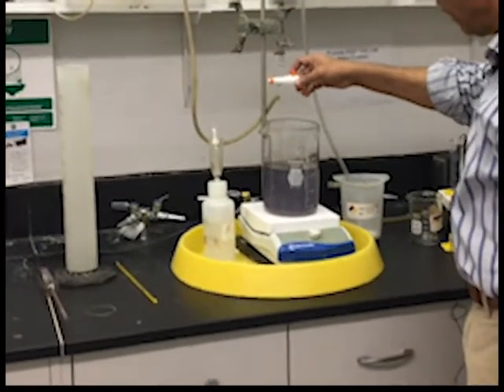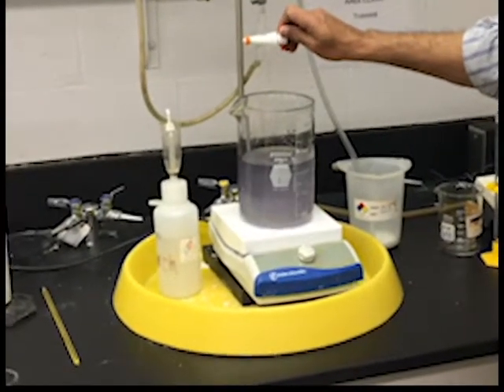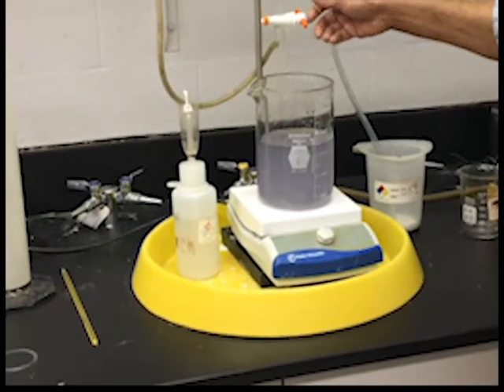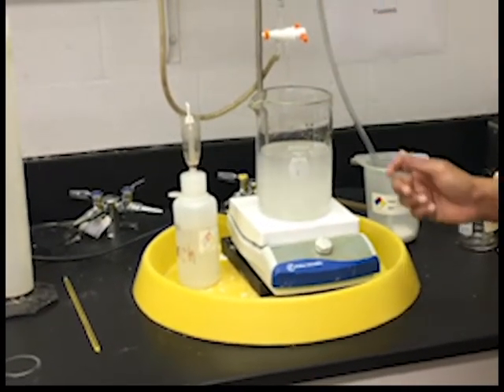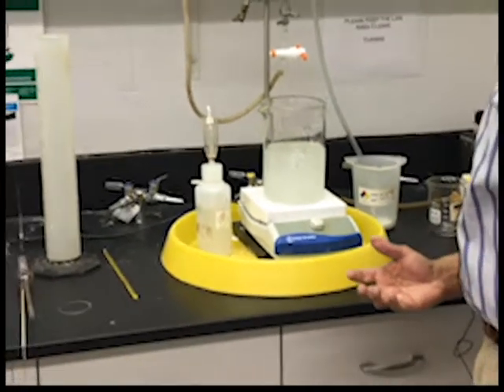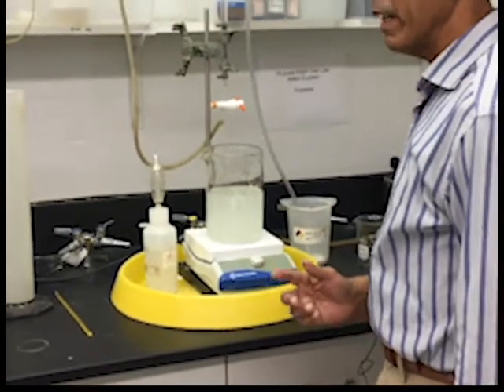You can see it is getting lighter — one more drop, a couple more drops — and the blue color will go away completely. So now I have completed my titration, and I can record how many milliliters of the sodium thiosulfate I used.